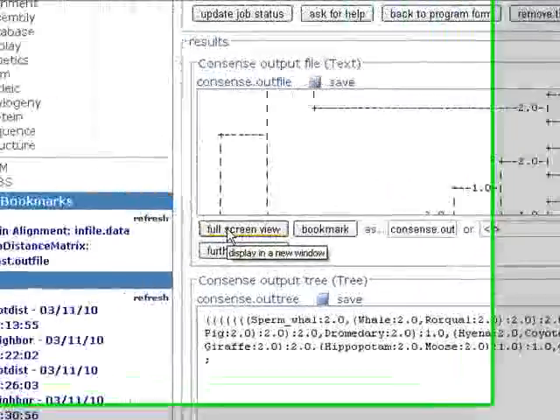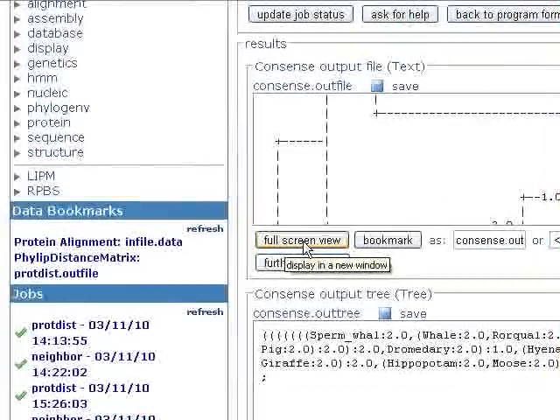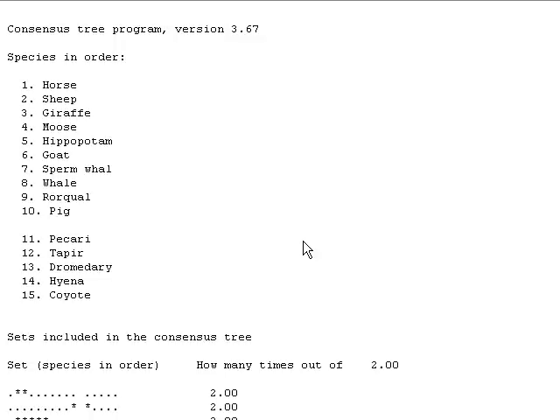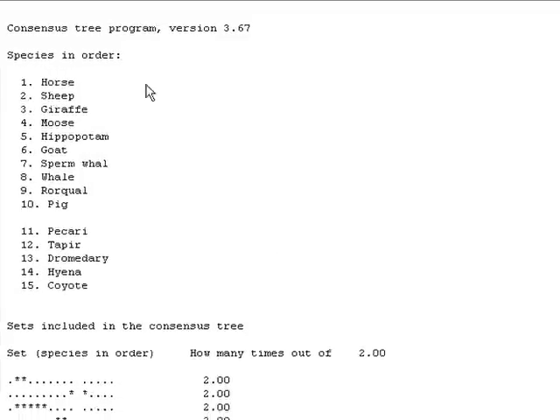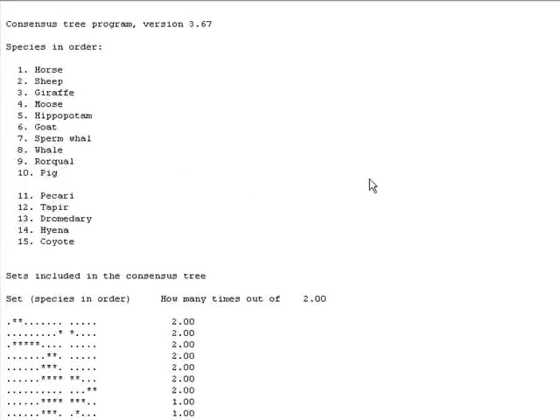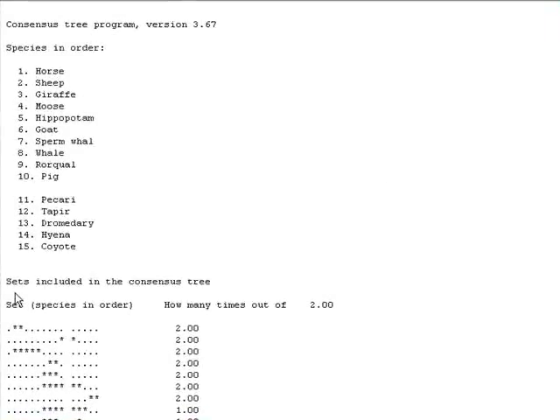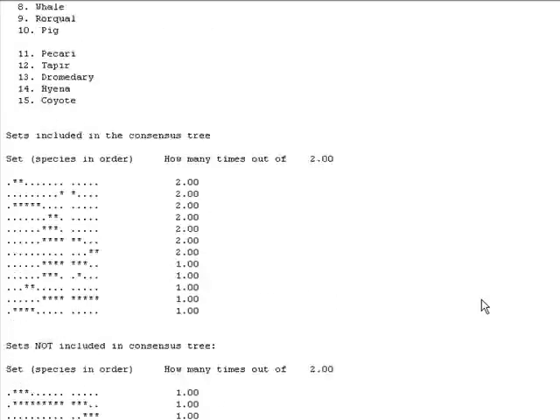If you want to see this in full screen, click this button. We have our species in the order that we provided in the multiple sequence alignment. Here are our sets included in the consensus tree.